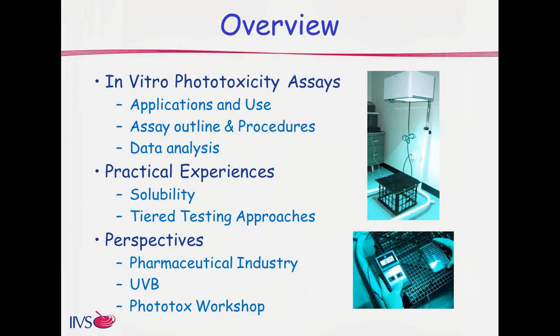Today we're going to spend some time talking about practical experiences using these assays, specifically solubility and tier testing approaches. These are some of the common discussion points for those who are working with these assays or have used them to assess photo safety. And finally, Dr. Manfred Liebsch, our guest speaker, will address current perspectives on photo safety testing, including those from a pharmaceutical perspective, UVB absorbers, and highlight some of the discussion points from the 2010 ECVAM 3T3 phototoxicity workshop.